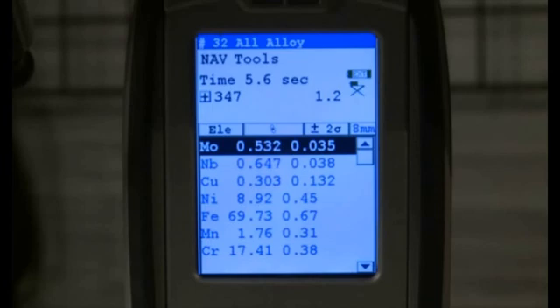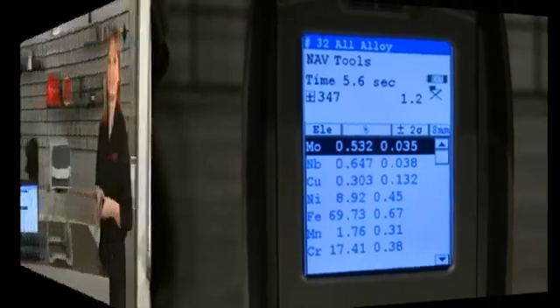Similarly, molybdenum, or moly for short, shows both analyzed concentration and calculated precision values. It is so important to be aware of the precision of each measurement that I often tell new users that no concentration number has any quantitative meaning until we know the associated error.